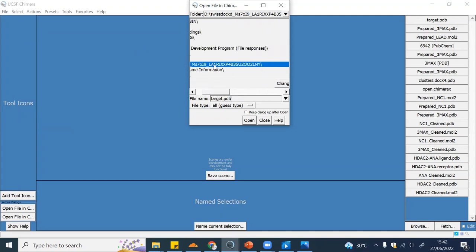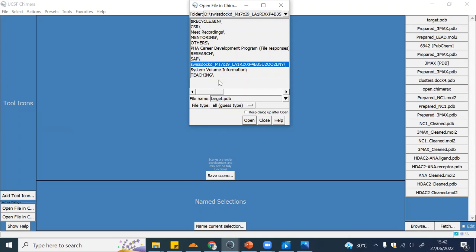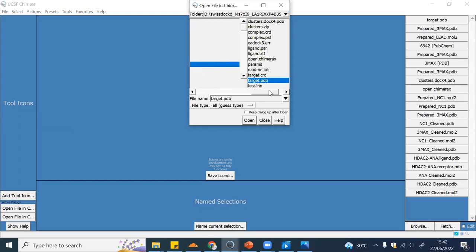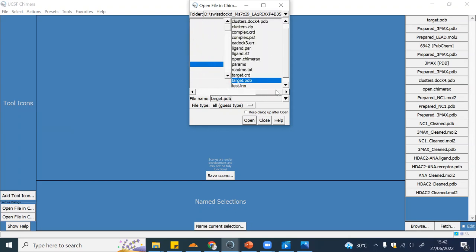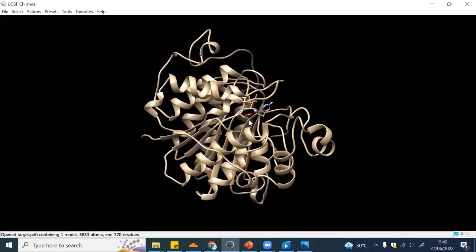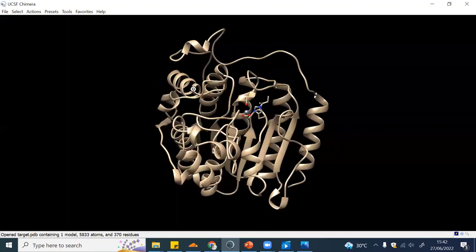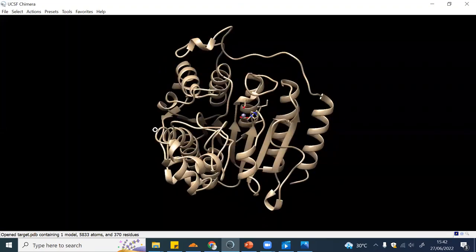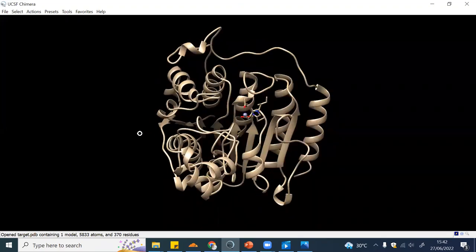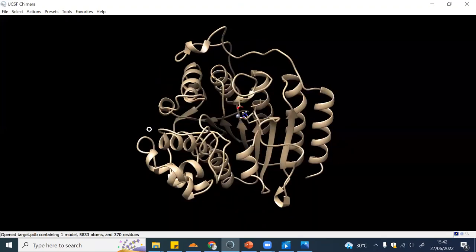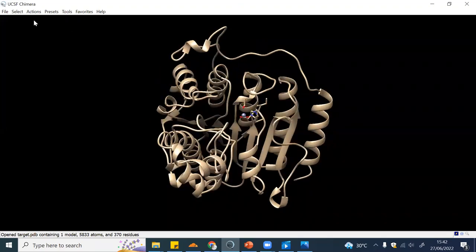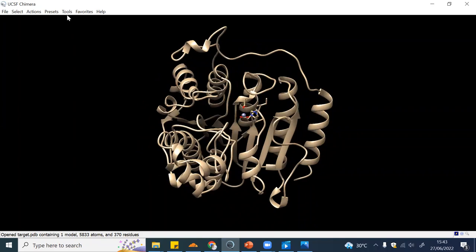I will open this one. I already know the location. I saved the SwissDock file and unzipped it. After I unzip it I have this content. I will open the target.pdb like this. This is from SwissDock, and now we will look at the docking result.